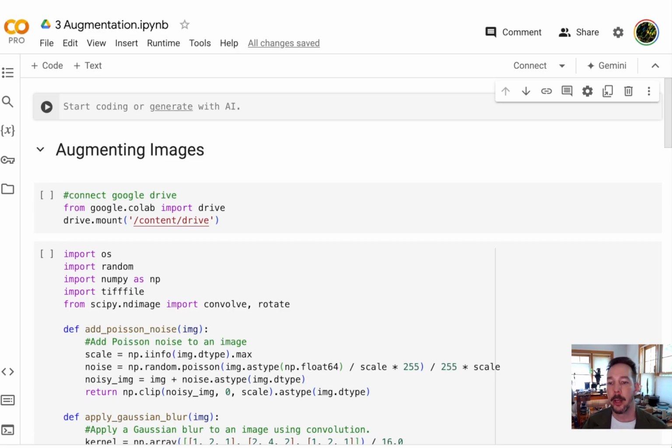Okay, so in this final example, I'd like you to work through using the knowledge that we have from our first two Colabs to create your own model for restoring neuron data. To help you get started with this, I've created some data of high and low signal to noise images, just like the ones I shared with you in the presentation.